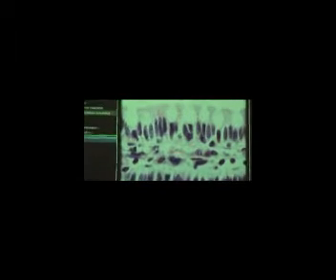If you're confused, it's labeled up here. All the cells are in a straight line. Now, this whole thing here is a villus. It's just a photograph of one that's right in the middle. So this finger-like thing comes out like this. It's multicellular because it's made up of numerous cells.